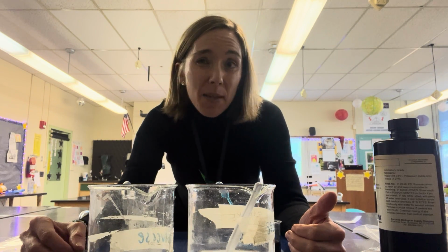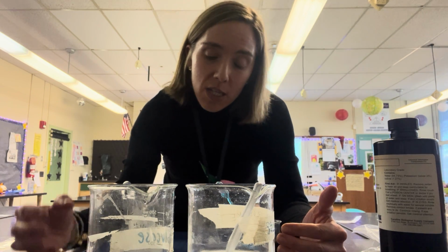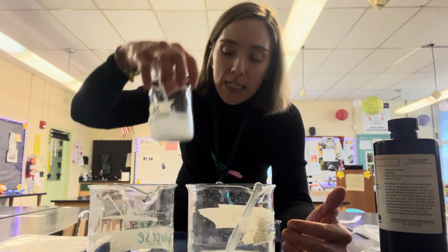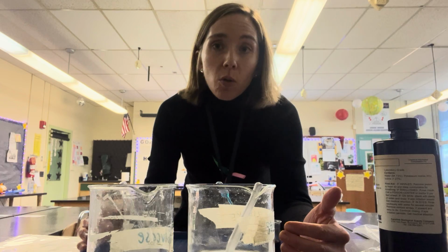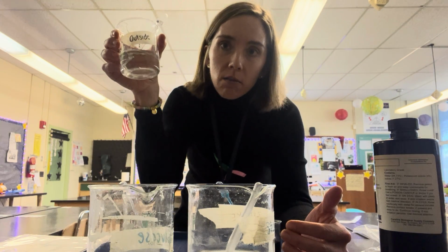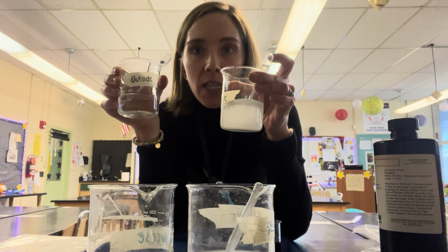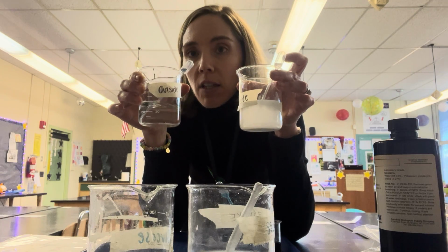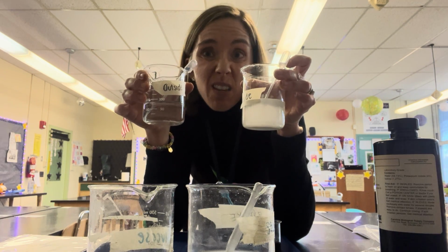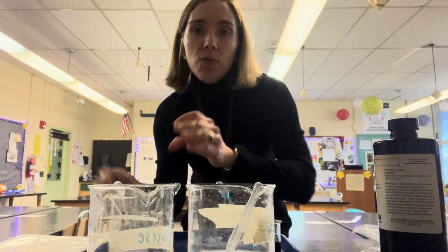To make things a little bit simpler for us, I took all of the liquid that was inside a bunch of the dialysis tubes and I poured it into a collective beaker. I labeled it inside. I also took the water that was left over in the beaker and put it in another beaker, saying outside. So I have the liquid that was inside the dialysis tubing overnight, and I have the liquid that ended up on the outside, the water, and if anything made it through, it should be in this liquid.